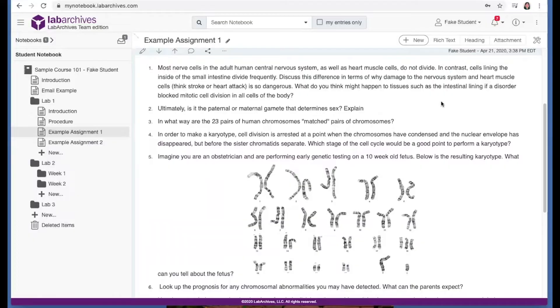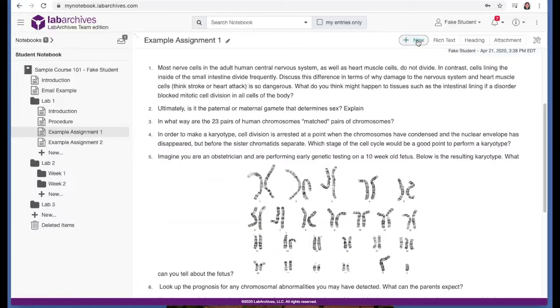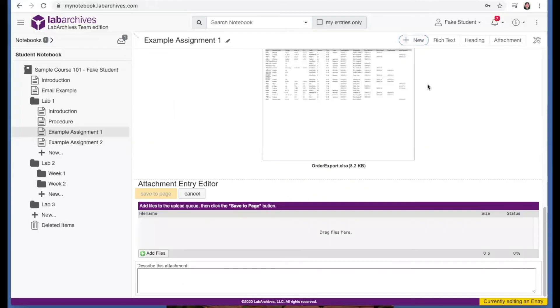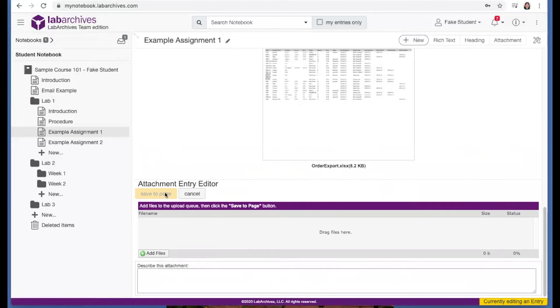You can also add attachments of any file type to the page by dragging and dropping a file right onto the page, or by clicking this plus new button and selecting attachment. Click this add files button to select a file from your computer, and then click save to page.